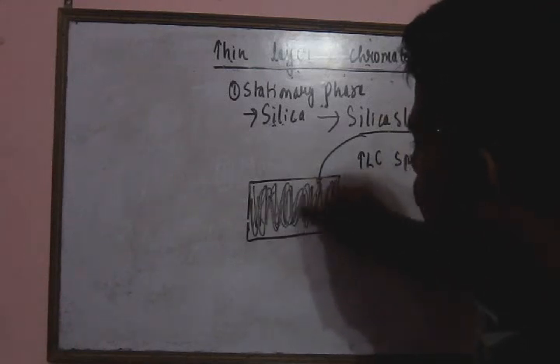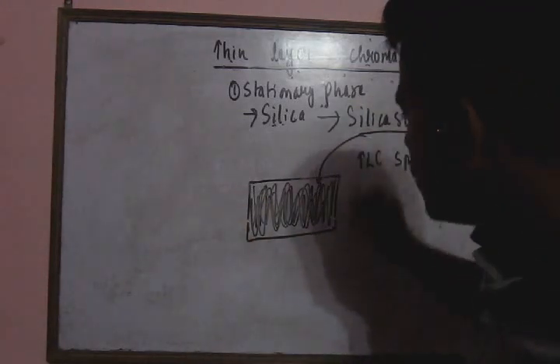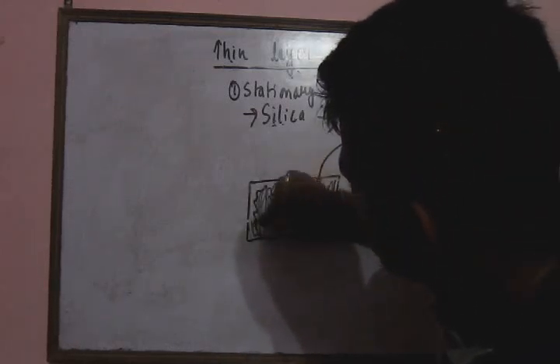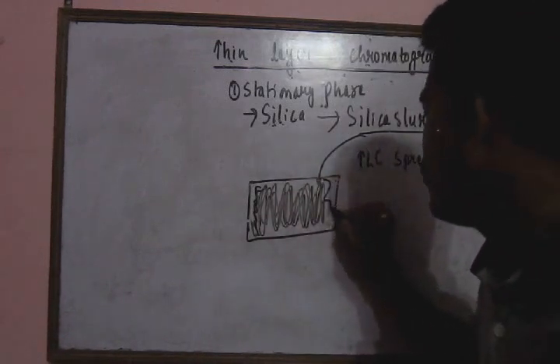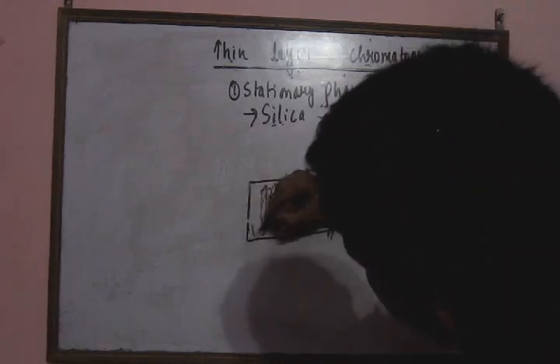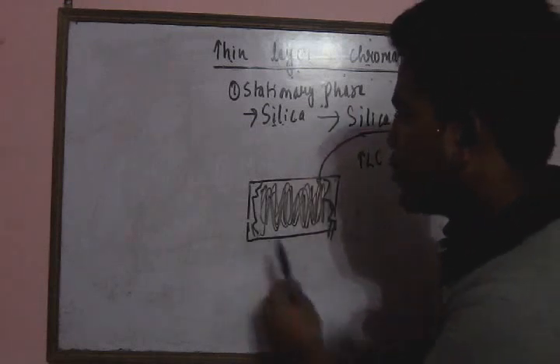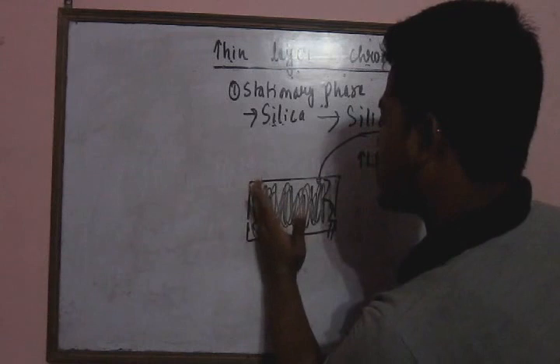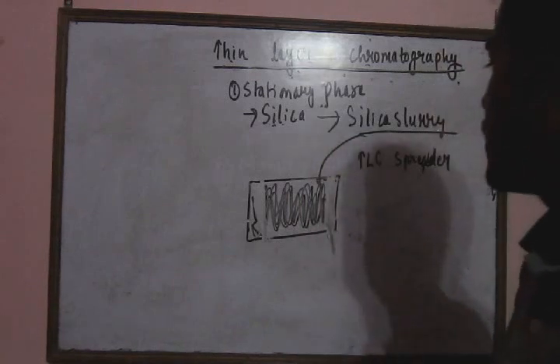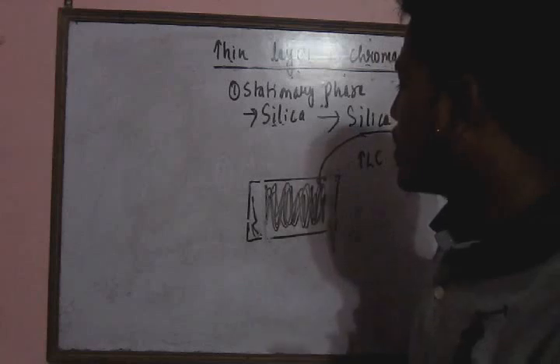After you put the slurry, you have to dry it and activate it. There may be some non-uniform distribution in the slurry, so the TLC plate may not have a straight edge. To fix this, you can cut it with a ruler or similar tool to make it straight, and in this way you can prepare the stationary phase.